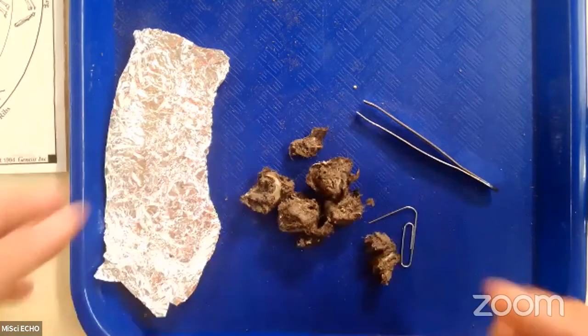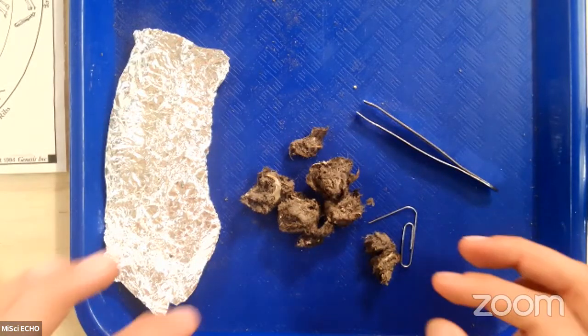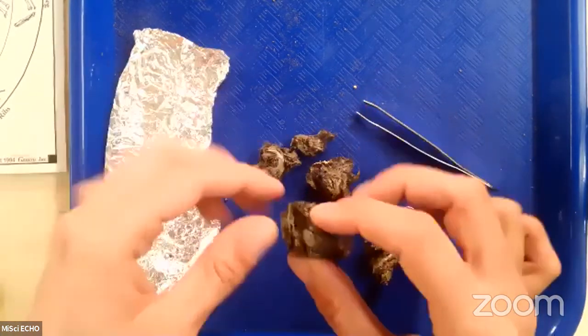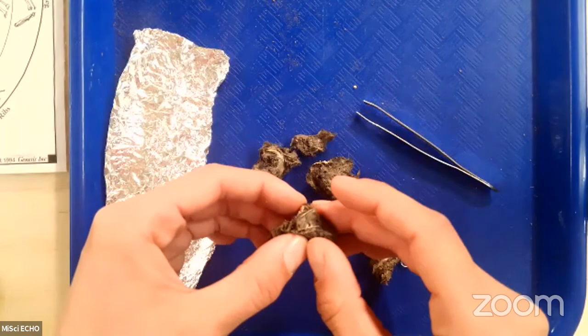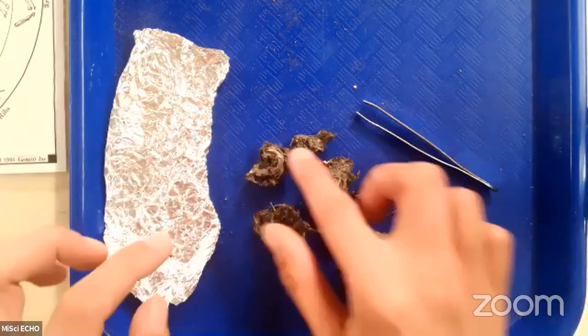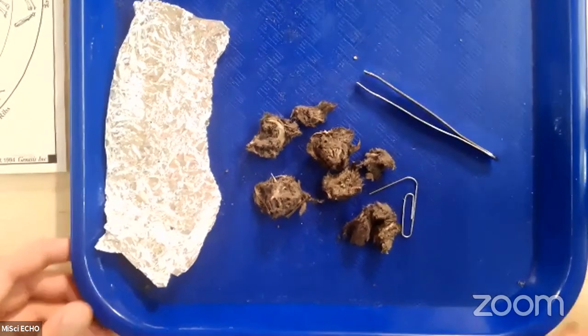So you can see that the first thing I've done is I'm just starting to break the owl pellet up into some pieces. Now, I'm not forcing it open. I'm not trying to break anything that might be inside, because you can see that just by peeling some of those furry pieces back, we're already starting to expose some very interesting things from inside our owl pellet.